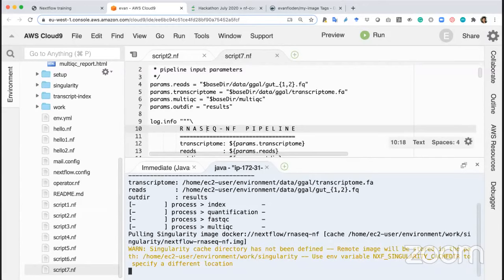This can be super useful if you are in situations where you want to, for example, have a group of people who are all working on a shared file system. They can all place their images in one place. And then if other people use them, or you use them across different situations, you only have to have one location for them, so the images don't have to be pulled all the time. And sometimes they can get quite large, several gigabytes for big, fat containers that you're putting tens of tools inside of. So something to keep note of.